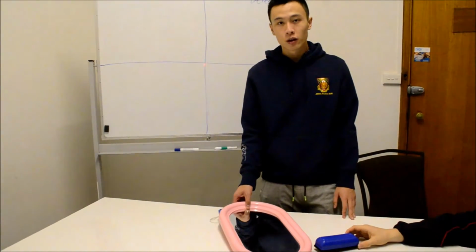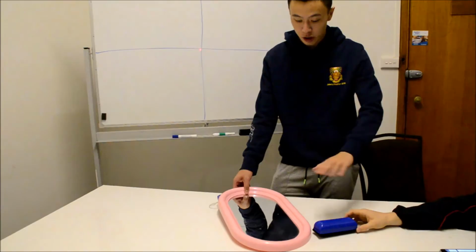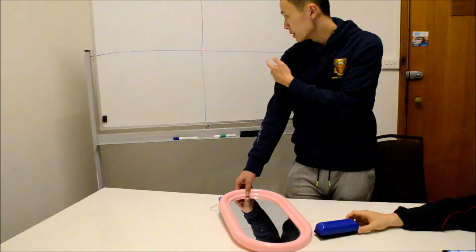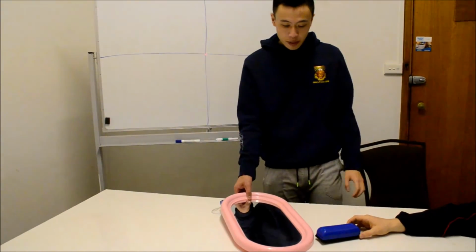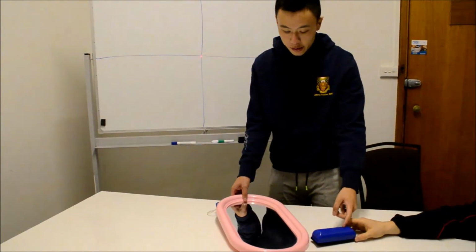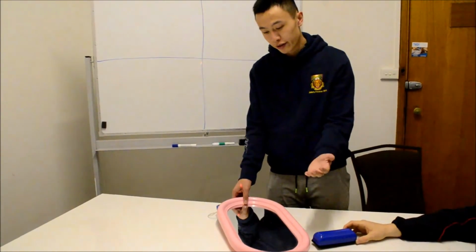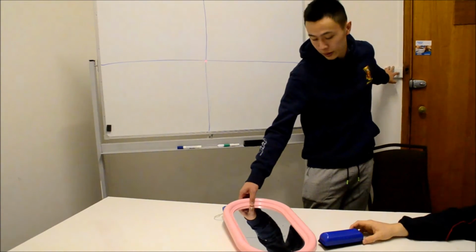Here we have a demonstration of the optical lever in human size. Over there, that is the laser. My arm here is the cantilever, and this mirror represents the cantilever's flat surface on the top of the tip. The tip is under here, and this is the detector. As you can see, the laser is reflecting off the tip onto the detector. This blue thing here will represent a nanoparticle, and when the nanoparticle goes under the tip, it will cause the tip to deflect and cause a deflection to be measured on the detector. Here we go. Okay, it's moving under. I'm going to move it out again.